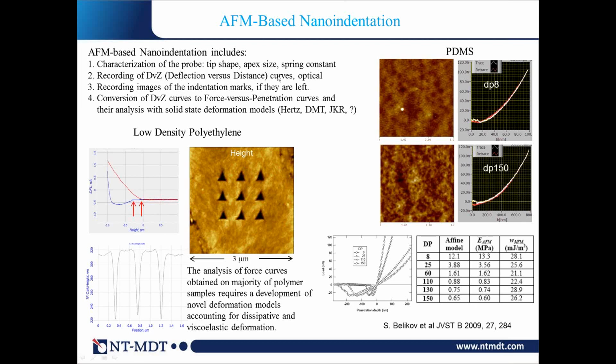Plus, you need to record these curves. That's maybe not difficult, but you should have in your mind that you can do it at different levels of the force. And your penetration in material can be reversible, can be irreversible, can be plasticity, and so on. That means you need to know, and depending on how deep your penetration is, that defines what type of model you need to apply to extract the numbers. Also, it's important in many cases to record if there are some indentation marks left, because this is an indication of the type of deformation you've done to the sample.